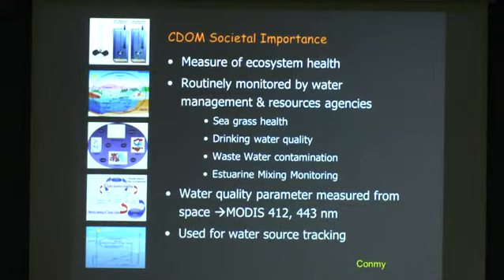It's very sensitive to wastewater contamination. There are a couple of amino acid-like signals that come in with wastewater. And this is having lots and lots of applications in places like Australia and probably the US Southwest, where they're working on reclaimed water systems for drinking water. Very sensitive. You can monitor the process in line.